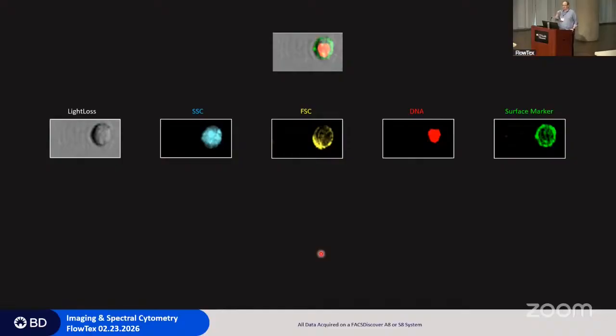darkness of the cell membrane oftentimes corresponds to the health of the cell. If you have really old cells or fixed cells for a long time, that cell membrane starts to deteriorate, and you can see it instantly. And you can see if somebody didn't wash it enough, or if they had a really tough sample prep, or if it's like a tissue and it's obviously a shotgun scatter, you can see all that debris and why it looks that way on the scatter. But that's all what I call the qualitative level of the imaging, where you can just use it intuitively.